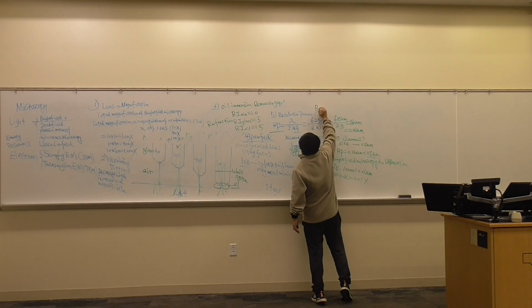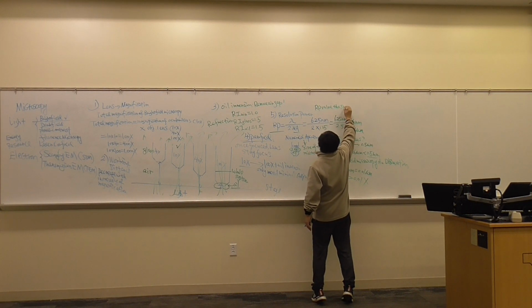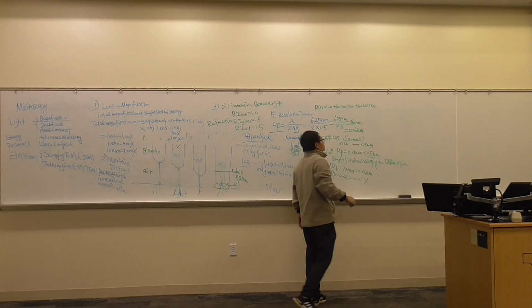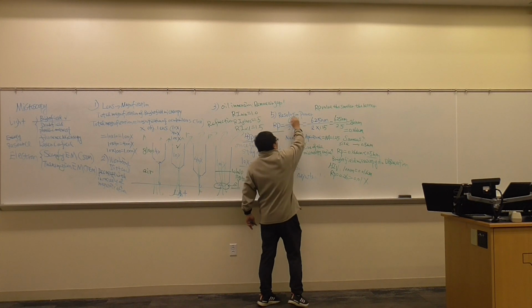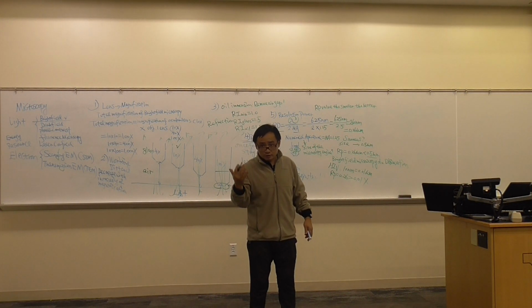Okay, so resolution power value, the smaller the better. Now, we cannot change 2. We basically cannot change numerical aperture 1.25. What we could change is this lambda. The wavelength could be changed.